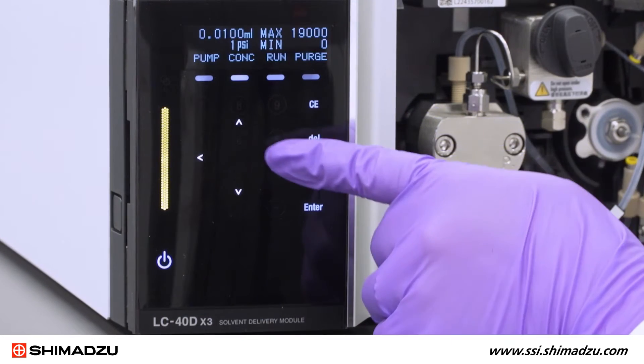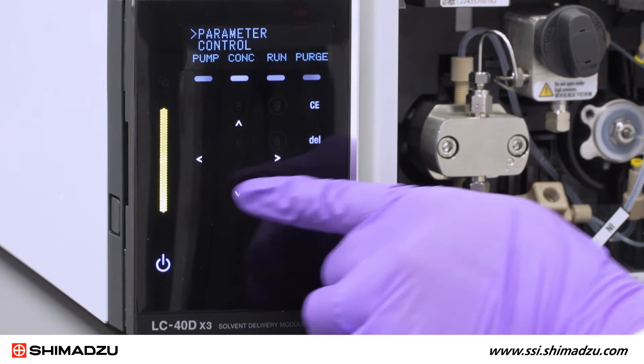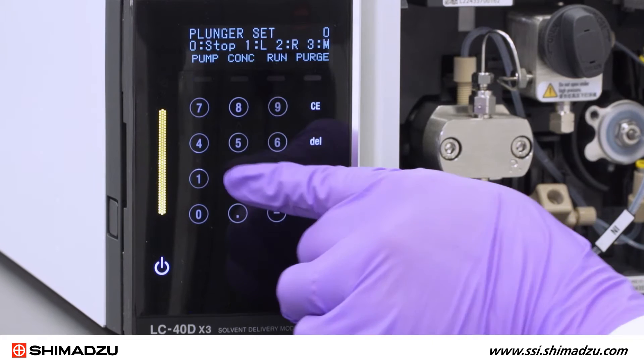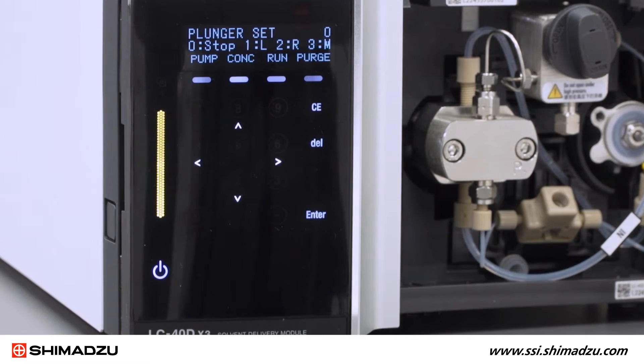Using the pump keypad and arrow keys, select Function, Control, Plunger Set. Then press 2 and hit Enter. The right plunger is now retracted as far as possible.